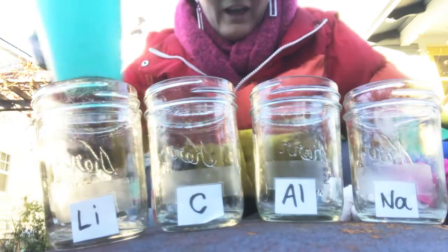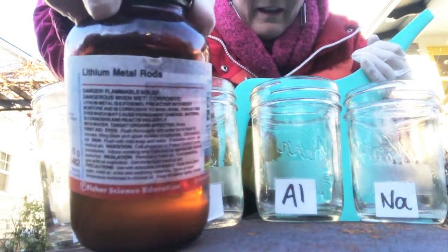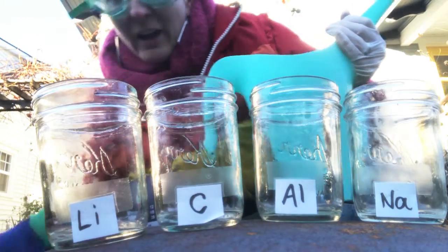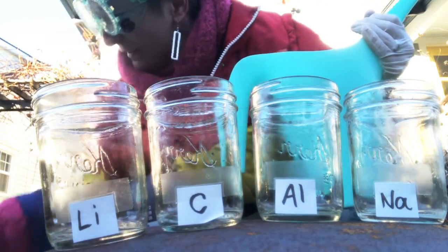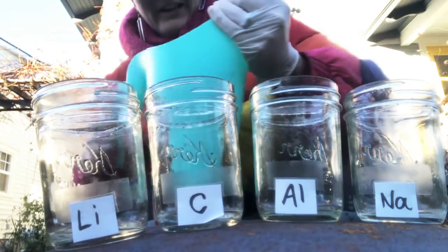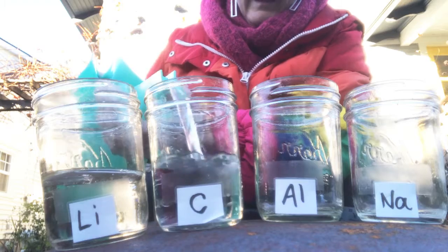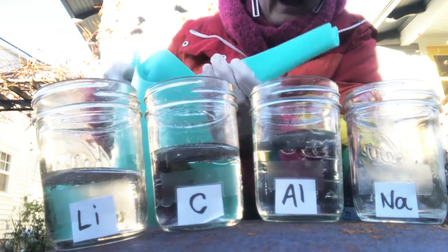So I've got my water here. I've got each of those things here. I've got some lithium. I have some carbon. I have some aluminum. And I have some sodium. All right, so I'm going to pour each one of these. We'll do these reactions one at a time, but I'll put each of these close to the camera as we are doing each one.